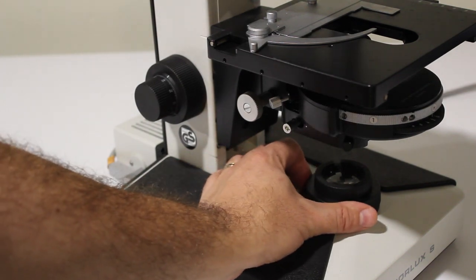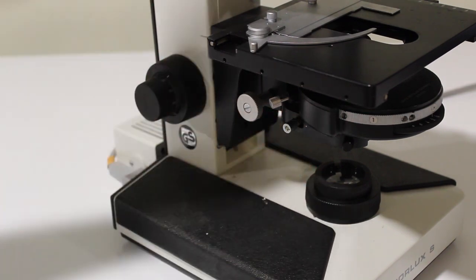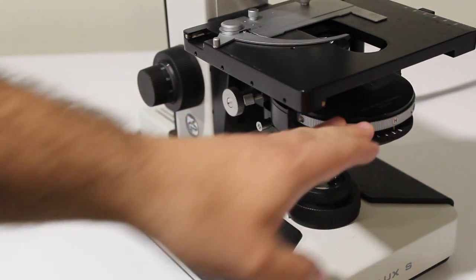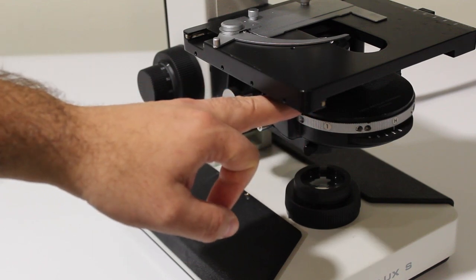So this field diaphragm allows you to adjust the shape of the light coming out of your lamp. The next thing the light's going to encounter as it moves up through the stage is this part here, which is called your condenser. And this is what really shapes the light so that you get a nice, even illumination with good contrast on your image.